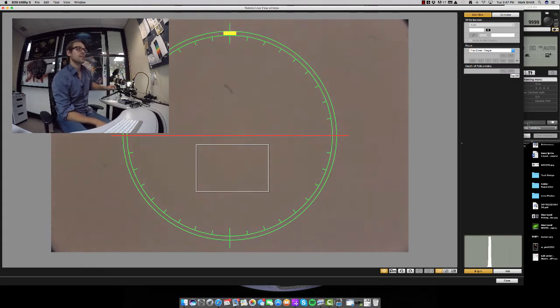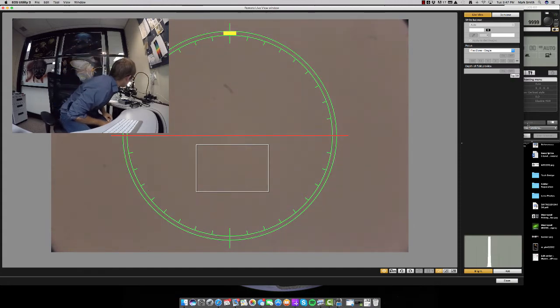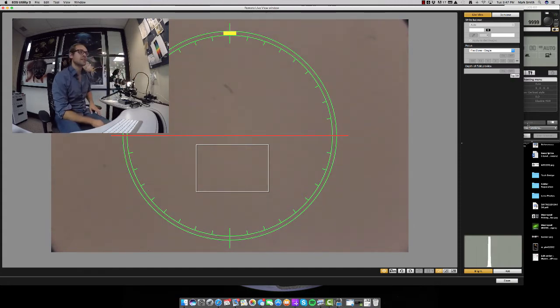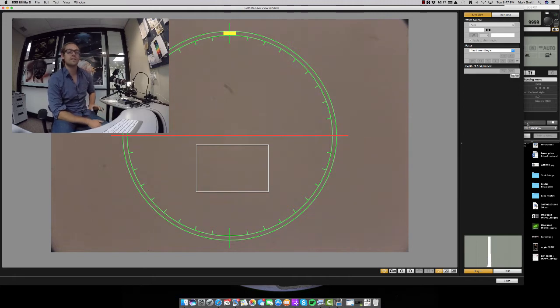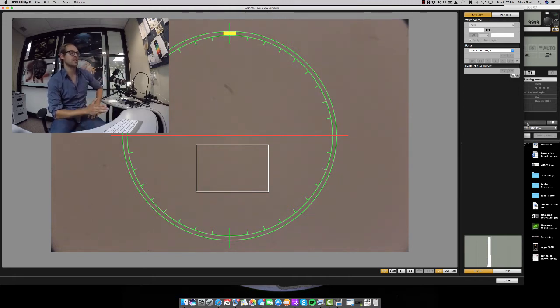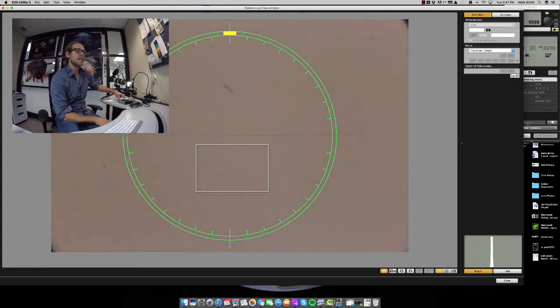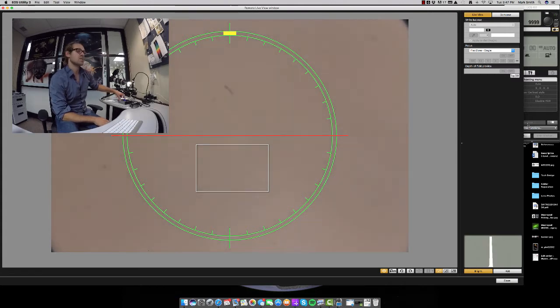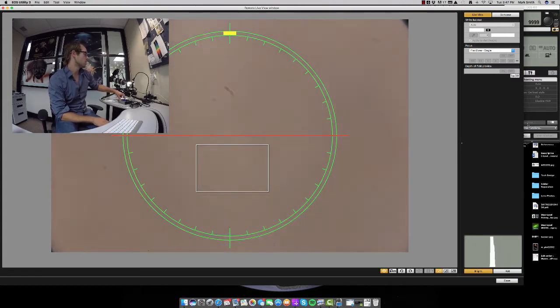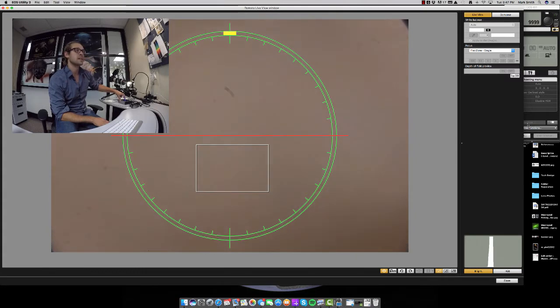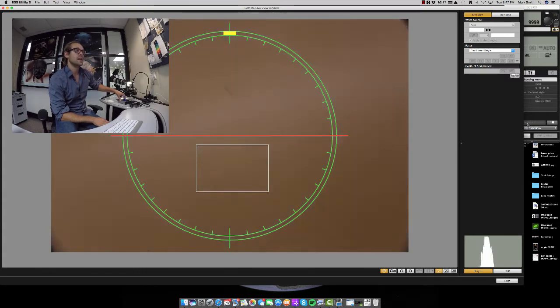You can see there's even a little bit of dust on the objective. I did clean these recently, it's not going to interfere with the shot too much. So I think for the demonstration, we're going to leave it there. But what we'll do is we'll move the stage forward just until the specimen starts to come into the field of view.